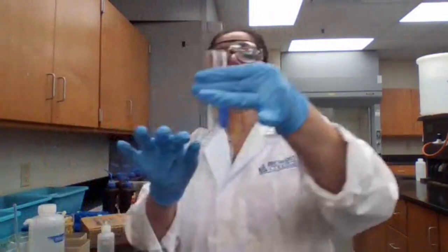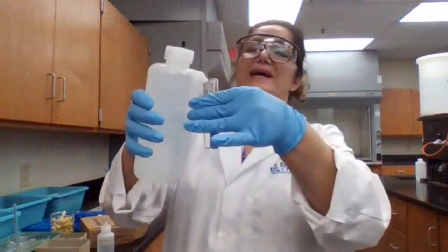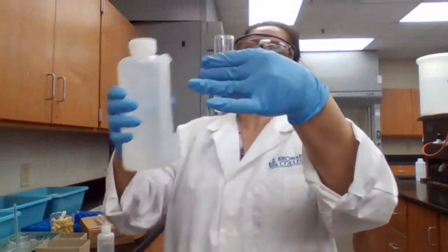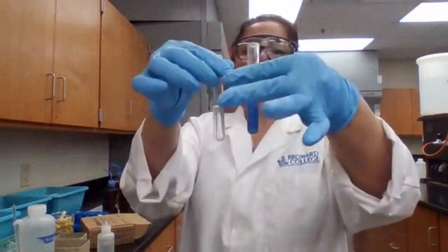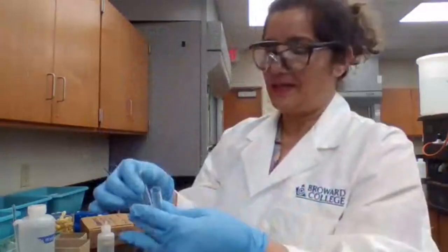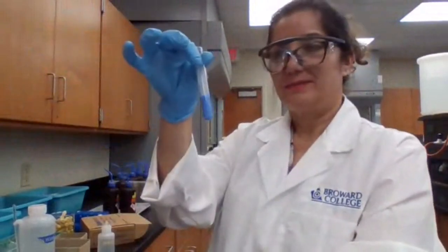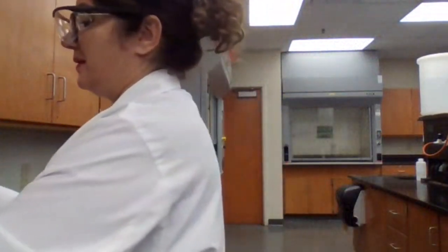The counterpart of the test tube that I'm trying to centrifuge has to have the same mass. So because the density of this solid now is greater than the water, I add a little bit more water because the mass actually has to be the same. For a perfect technique, I should place it on the balance, on the scale, to see how much it weighs and then make sure that the other test tube weighs the same.